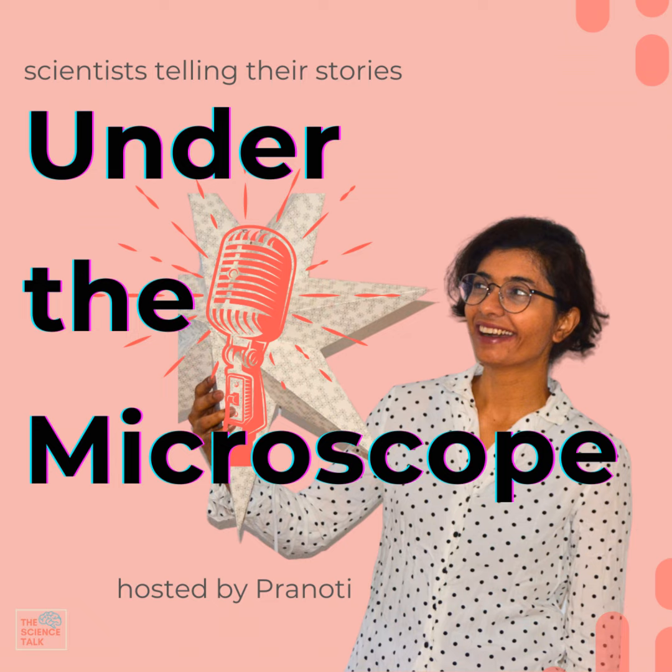Aha, okay. Oh, that's interesting. So it's not about... okay, got it. But the 3D information you can also get from a TEM or a SEM, with electron microscopes, right? Why use the atom probe microscope?